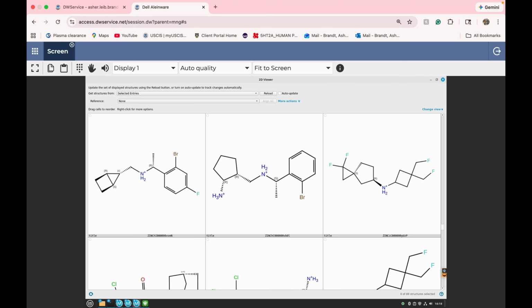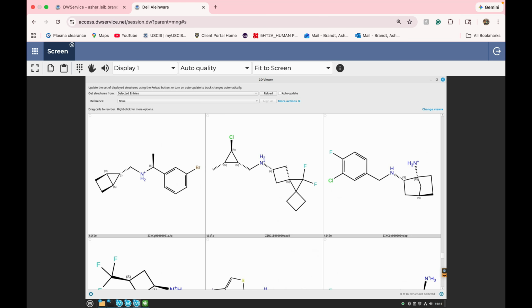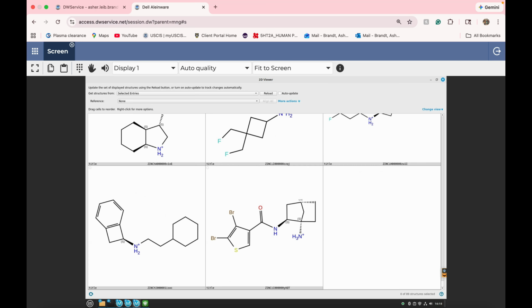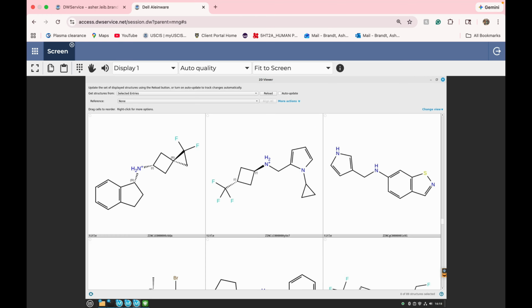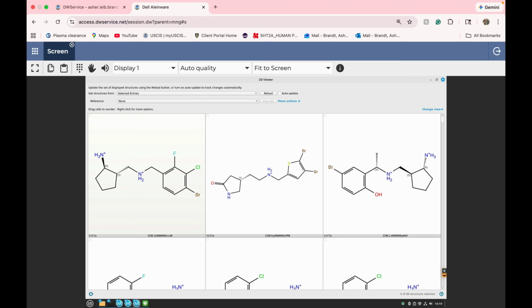And there you go. As it stands, this project, the overall outcome is complete, right? We would need to either make these molecules or buy these on a service like Molport, do some in vitro testing to see if they actually bind to NMDA receptor, and that's as far as I'm going to take this one. Thank you guys for coming along on this video series.